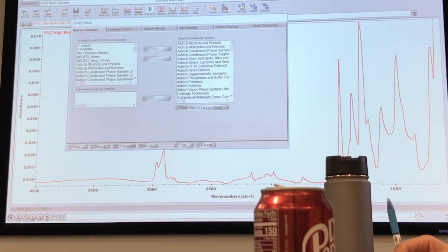In the area that you're looking at, I think in a couple of months, or maybe six months to a year, there will be a lot of labs that may come out with really nice quality spectral libraries, right? Sorry, I'm putting pressure. I know Chelsea's lab is working on those in Hawaii. Dr. Jen Lin's lab is working on those. So there are multiple labs putting a lot of effort into getting these polymers, weathered polymers, colored polymers, name the polymer in all the different formats. And if it comes out and if it's open access, it's going to be a really great source for all of you.